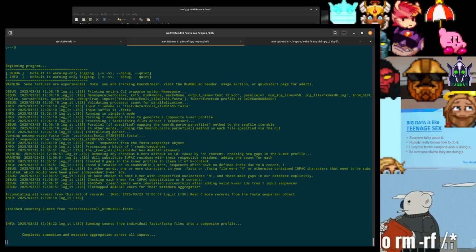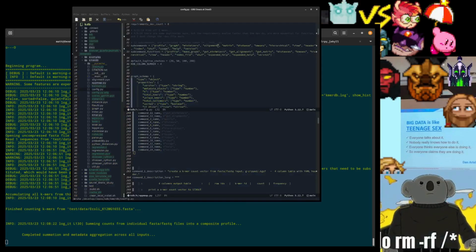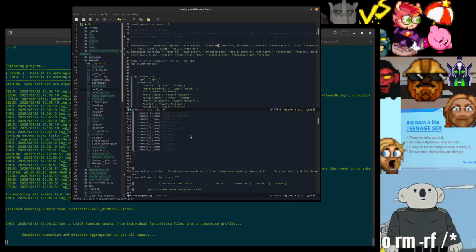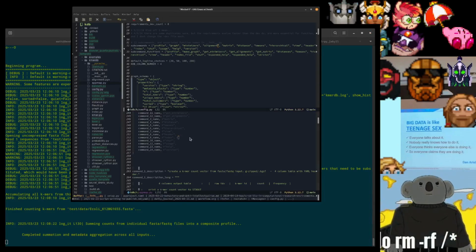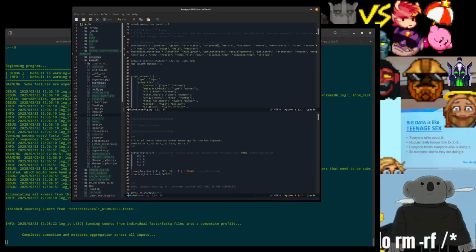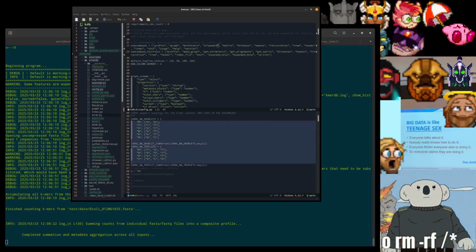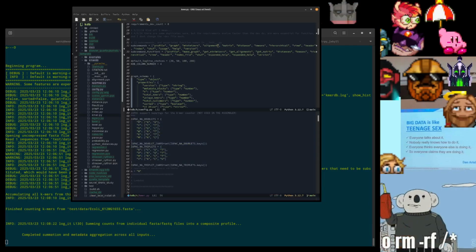While I have you here, I'll bring this to the forefront. I recently patched the kmer module. So here's the doublets and triplets stuff that I was talking about earlier. So these are triplets.